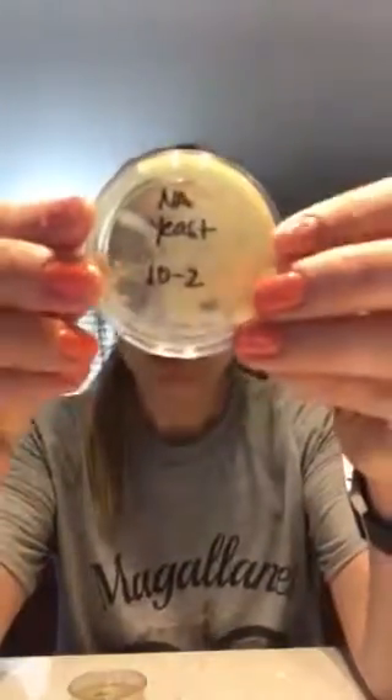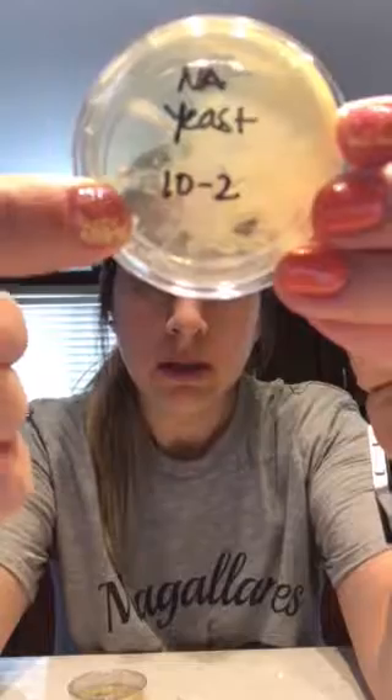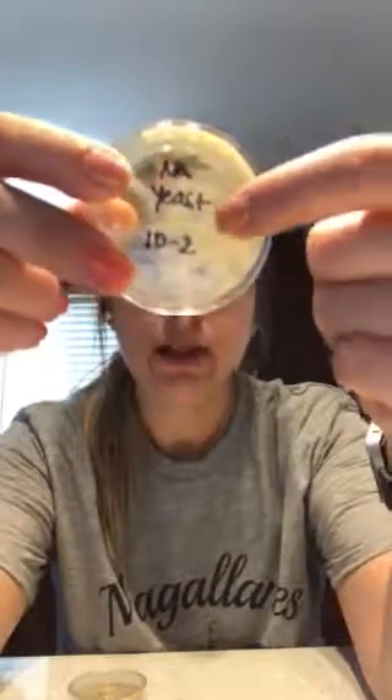Same thing with sample 10^-2. You can see maybe one, two, three, maybe a few on the side, but most of it is all stuck together on this side as well.